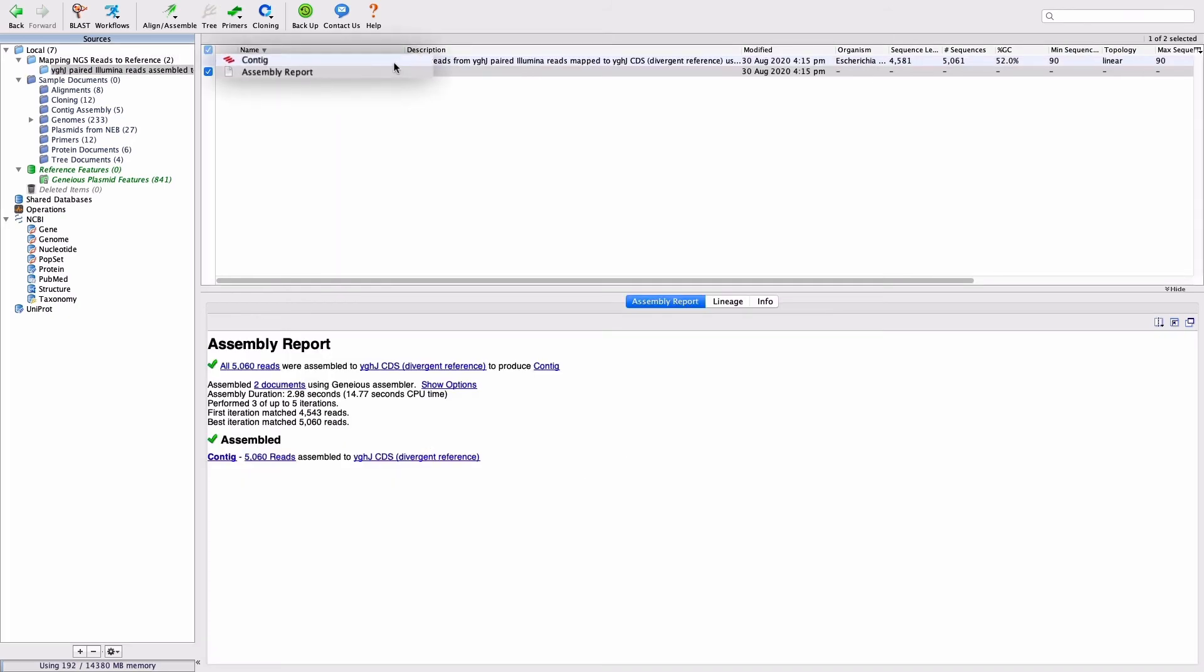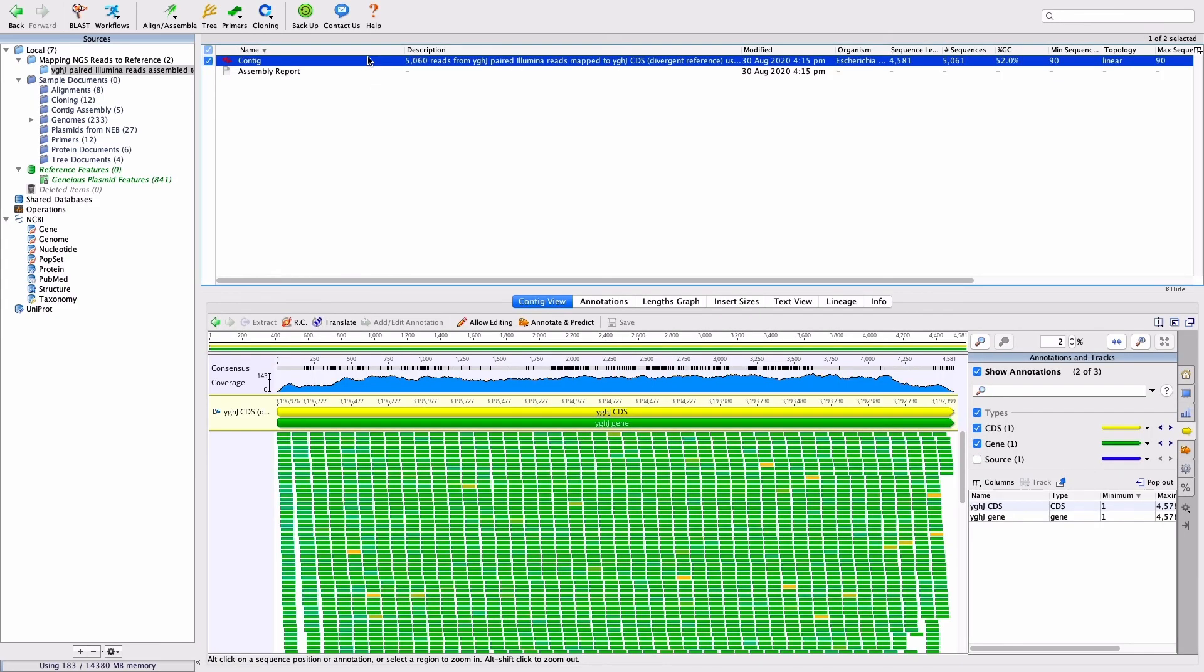Two new documents should now be created in your document table, a contig of the reads mapped to the reference, and an assembly report. Click on the contig to view the reads mapped to the reference sequence.